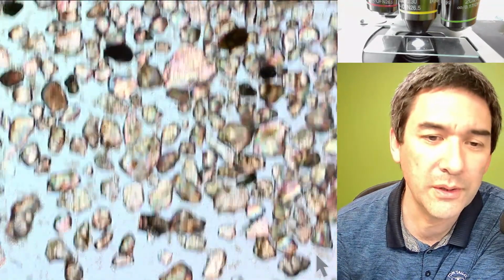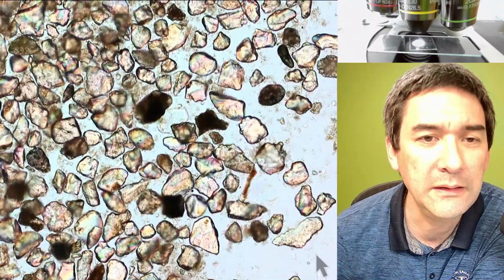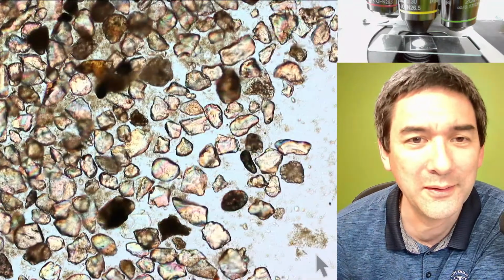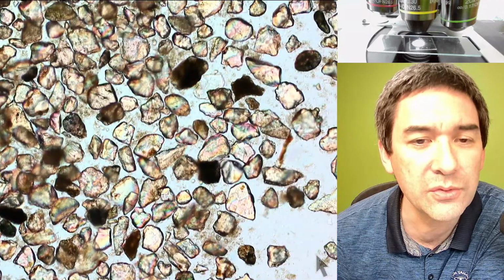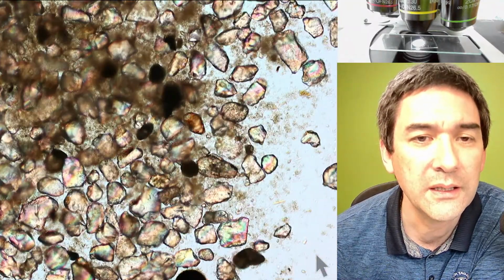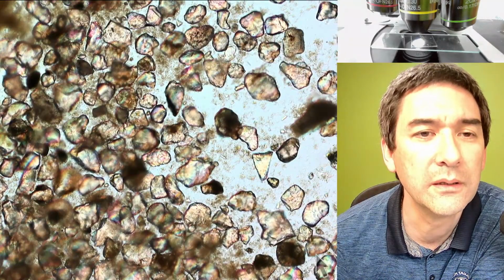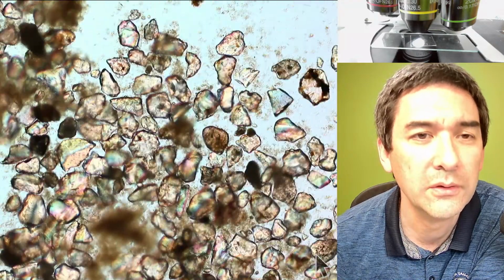I mean, one always has to be aware that bacteria are still significantly smaller. I'm quite sure that there are plenty of bacteria in here that have survived. So saying that it's completely dead is probably not quite the correct thing to say. But at the same time, I also do not see a lot of diatom shells. A couple of months ago, I used to see quite a few of them. I wonder if they've also broken down, but those diatom shells are made of silica and they are quite stable. So I am a little bit surprised that I don't see anything at all.